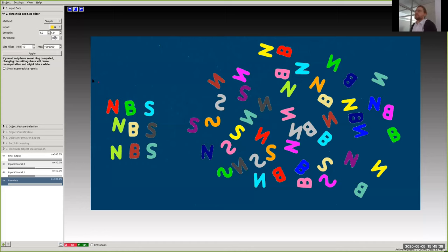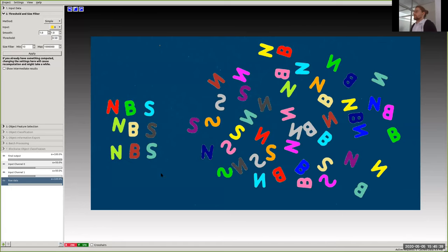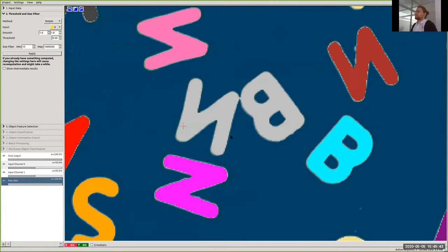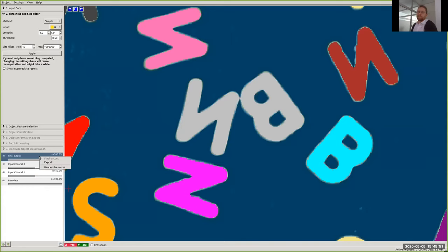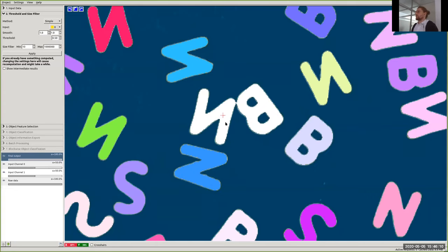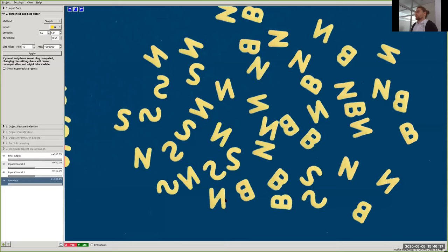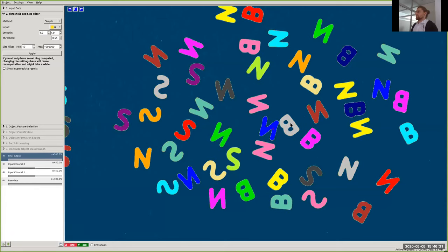If you change the threshold — for example going lower — the letters get thicker. A higher threshold gives more accuracy in this case. Sometimes letters like E and N may appear connected, but this can just be because they happen to have the same random color. You can right-click on the final output layer and select 'randomize colors' to get a new set of colors. Doing this confirms whether objects are truly connected or not. I'll solve any actual connections by supplying a slightly higher threshold — and now those letters are not connected anymore.